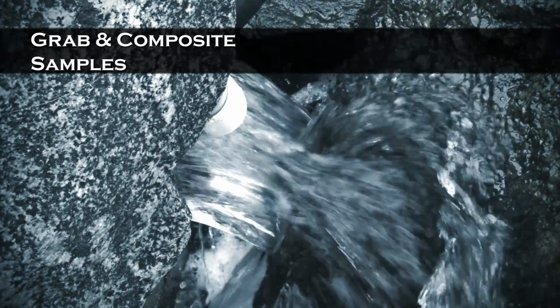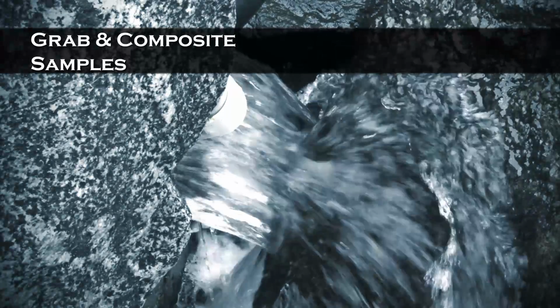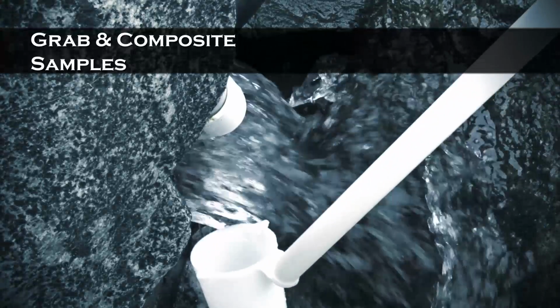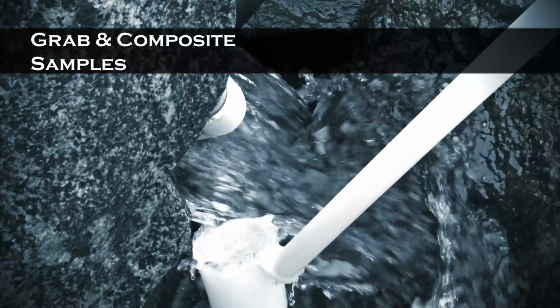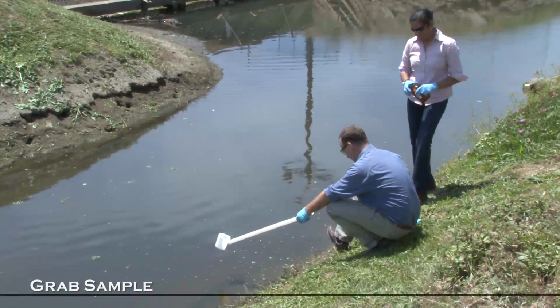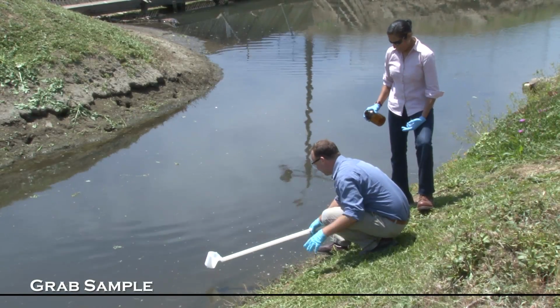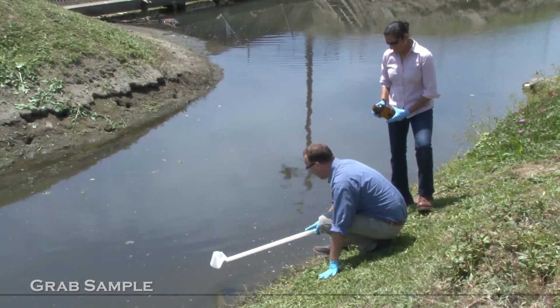Now that you have completed the sample labels, it's time to discuss the two types of samples, grab and composite, that are collected and shipped during sampling activities. Let's start with grab samples. Collect one grab sample within 30 minutes after discharge begins. This sample will be used to provide data on the first flush of the stormwater from the facility.